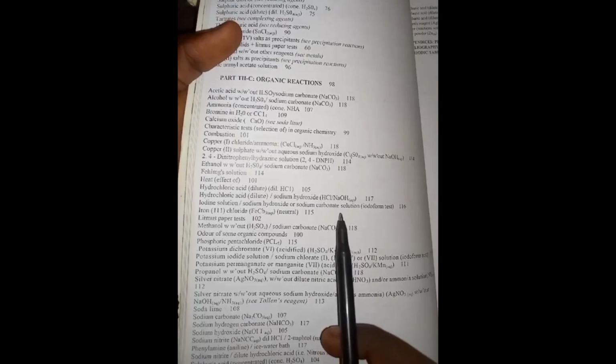Good. So guys, as you can see, let's look at it. All right, good. I think this is it, guys. We have iodine solution with sodium hydroxide or sodium carbonate solution, iodoform reaction. Good. So we go to page 116, sorry, page 116, not page 16, guys. 116. Good. So as you can see, this is it. I have the iodoform test. This is the table of observation.